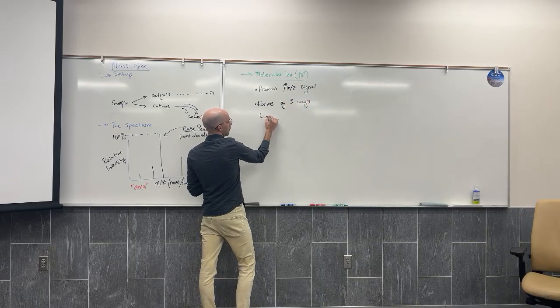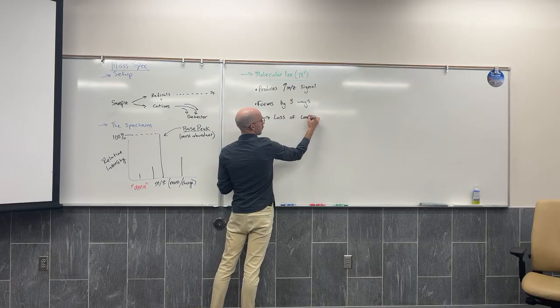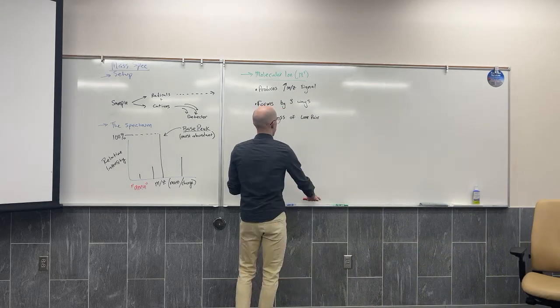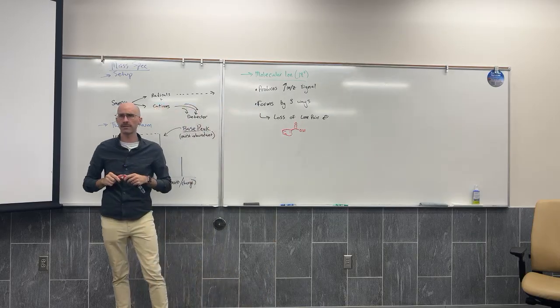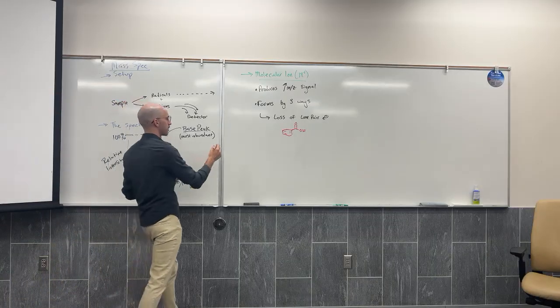So first, let's say we have a compound, and let's use benzoic acid, which is given to us in that first structure. We have a compound that has lone pairs. How many lone pairs in benzoic acid? Let me give you some options.